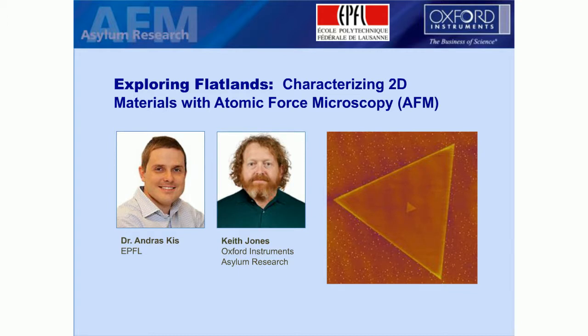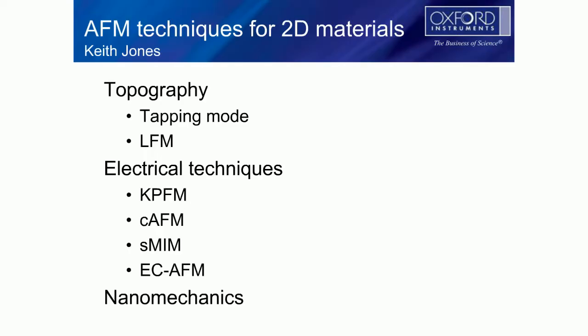So what I'm going to talk about today is initially basic topography and some advanced methods of topography that allow us to get accurate imaging. And the screen came back, good. Okay, so I'll talk about tapping mode and LFM, and then I'll talk about some electrical techniques, including KPFM or surface potential imaging, Conductive AFM, SMIM, a little bit about some electrochemical work that was done over at Oak Ridge, and then coupled with that, they did some nanomechanics as well.